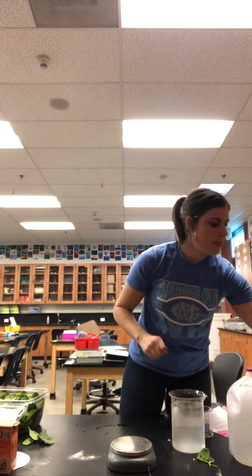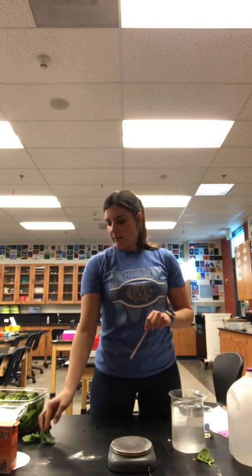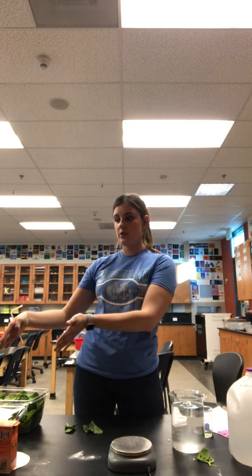Awesome, okay. In the setup of this lab, we're going to separate into 2 groups. I'm going to have 2 students work on the light reaction and 2 students work on the dark reaction. The reason we want to test both is to compare the 2 at the end and see how the exposure to light or lack of exposure to light would affect the rate of photosynthesis.